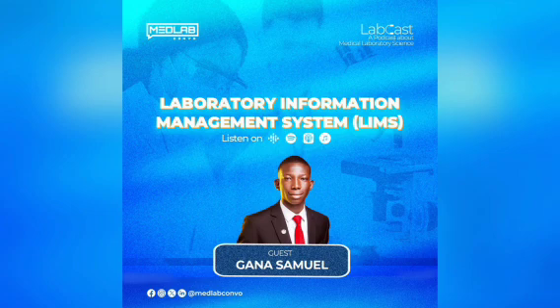Now, a cloud-based LIMS has lower initial cost. And as your lab begins to upgrade, as your lab begins to increase, then you can begin to add other things. Now, there are some important things that every lab will need, and these serve as the foundation for what a lab stands for. For example, every sample needs to have a sample handling system, which LIMS can provide.